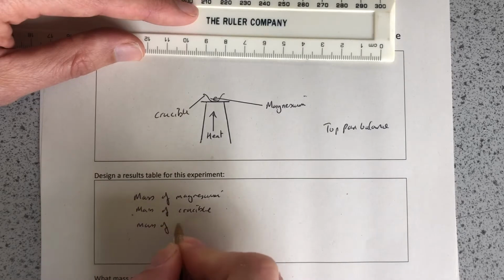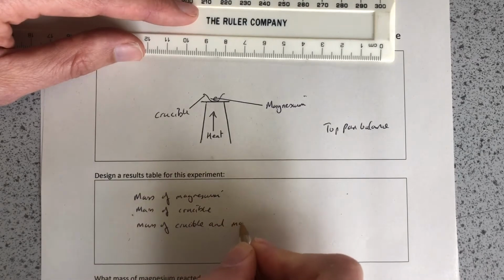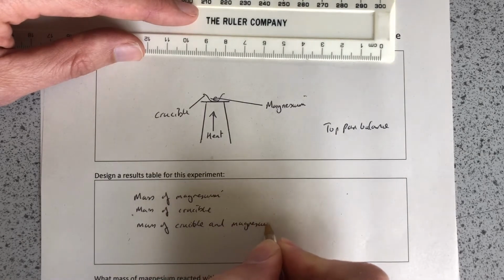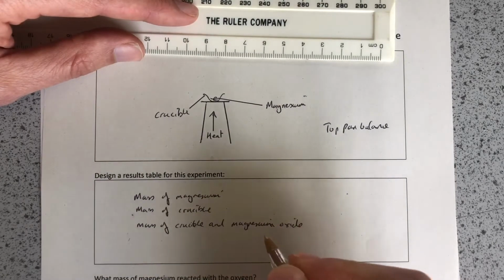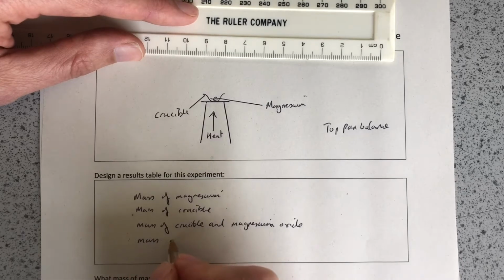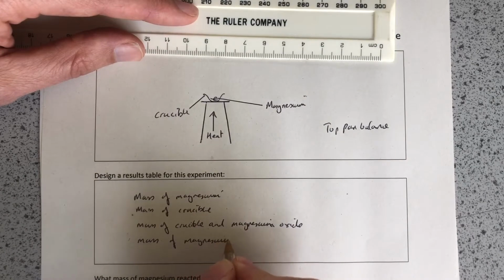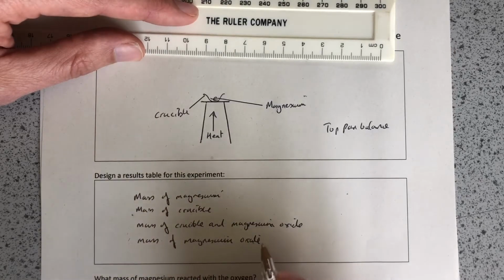Mass of crucible and magnesium oxide. And then our final reading will be our subtraction, which will be mass of magnesium oxide. So we're going to take the crucible mass off the crucible of magnesium oxide, and that will give us this last reading.